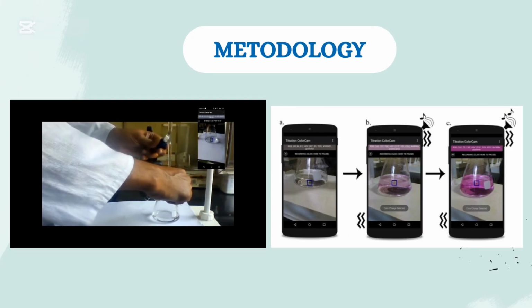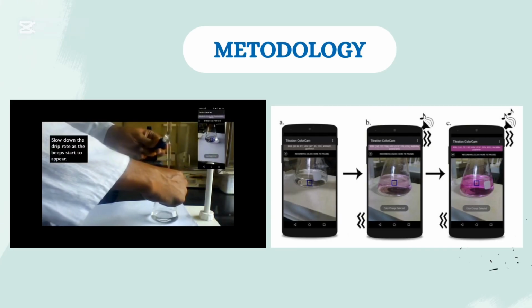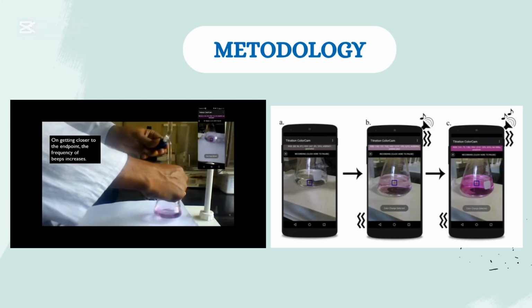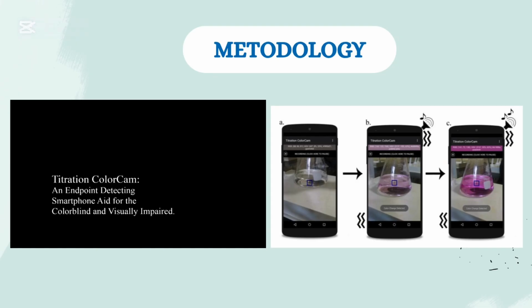When the detected color approaches this range, the app emits an early alert with a short beep, indicating that the endpoint is near. If the color remains stable within that range for several seconds and with enough saturation and intensity, the app confirms that the endpoint has been reached by emitting a long beep and continuous vibration.